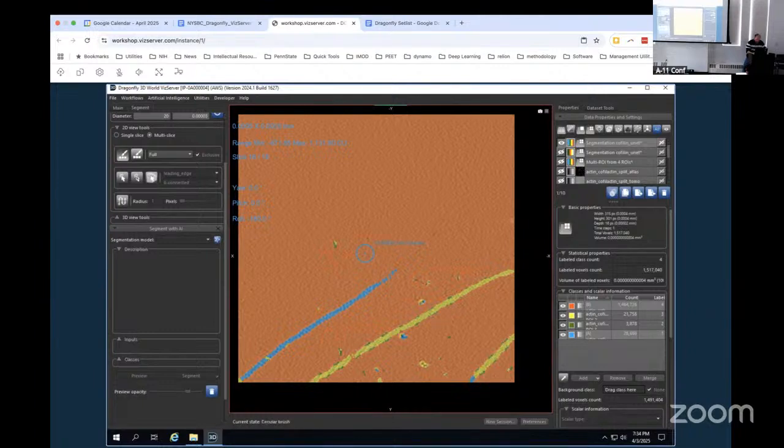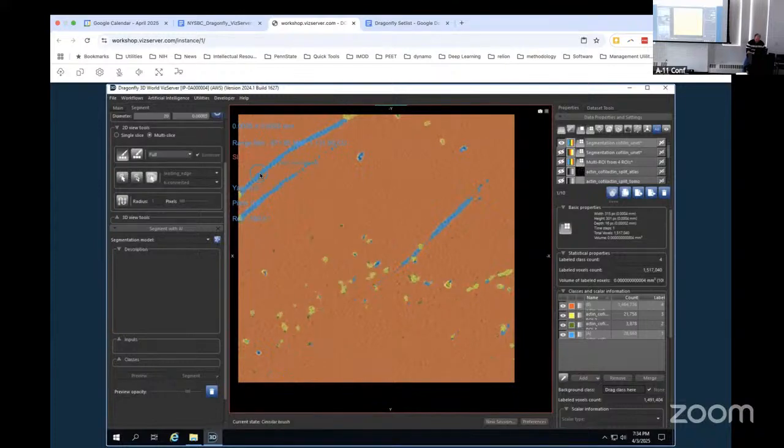Well, it didn't crash, but it's a real pain. All right, see, so if I pick yellow and orange, yellow is this thing and the orange is the background. So if I hold select, it'll let you push all of that into the background.